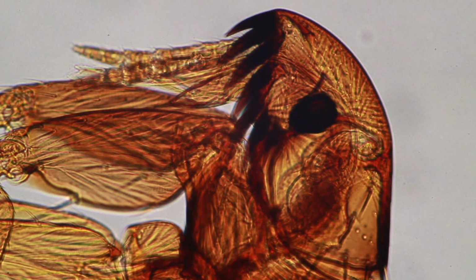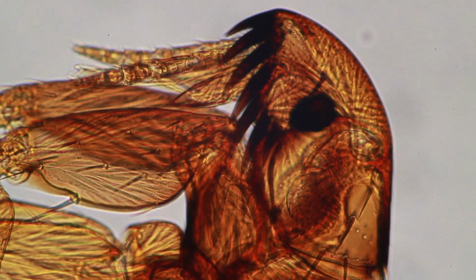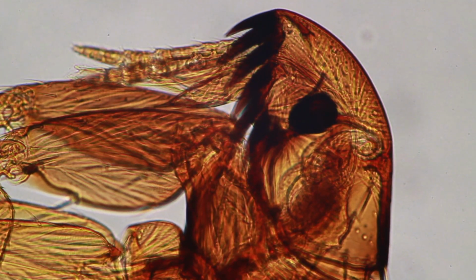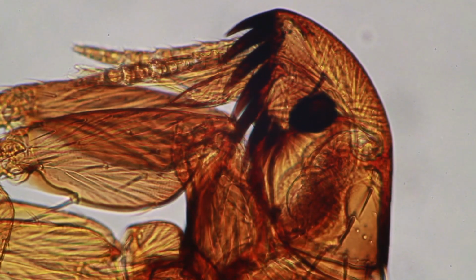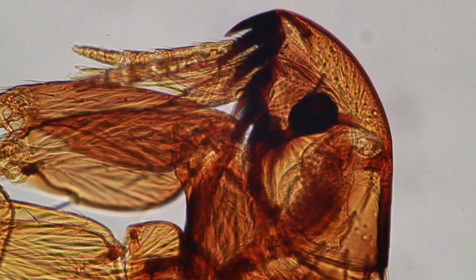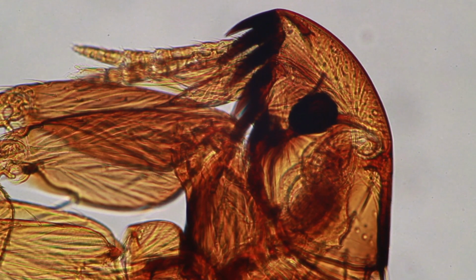The depth of field is higher, but interestingly, even though it subjectively might look better, because you might see more details, actually the resolution is lower, and all of the sharper corners that you see are often diffraction patterns. So it means it's not really an authentic representation of the image, but the corners simply appear to be sharper right now because of the diffraction of the light.